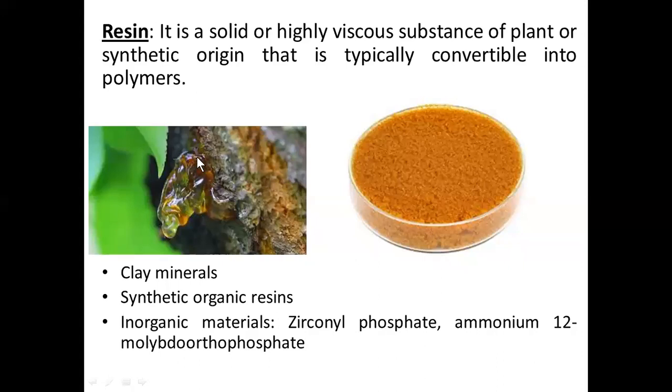So this is a resin. This is not a pure solid. This is a highly viscous liquid, and it has very good flow ability. Of course, chemically, we can say that this also has a certain degree of cross-linking, so that's why it has sticking ability. Because of the property of this resin, which we can get naturally, the sticking ability is obtained.